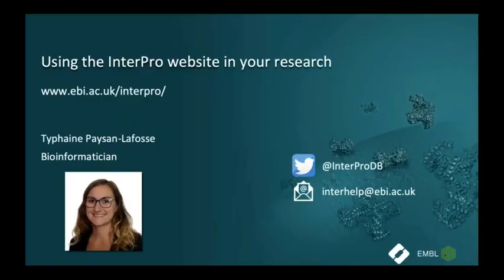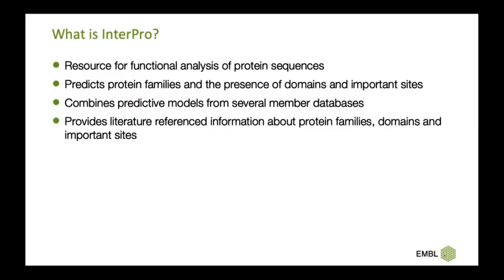But today I will show you how you can use the InterPro website in your research. To do so, let's first have a quick reminder about what InterPro is. It is a resource that provides functional analysis of protein sequences.